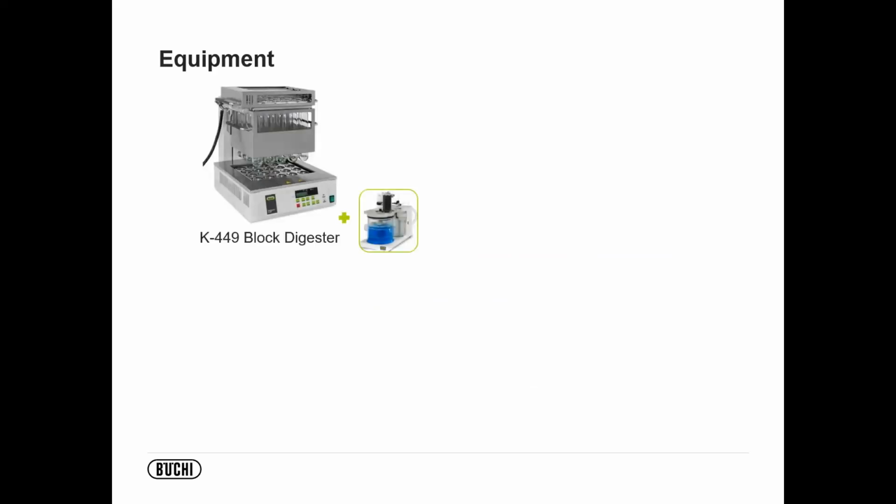All right, so for the equipment, this specific application note is from a real-life run of TKN samples. We're using our block digester, as stated within Standard Methods, so we're using block digestion as well as a scrubber. The scrubber is basically going to pull any of your acidic vapors and neutralize them. There's also some charcoal in there for absorption, and then condensation as well.